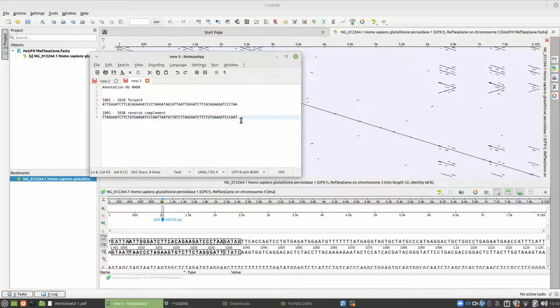What do I do with these two? Well, I want to look for my TATA box. I don't know that I have a TATA box on this one, but I might, and that was an interesting piece, and it was in the right spot. I figure that's near the beginning of this sequence, near the beginning of the gene, probably. It probably begins in that area.